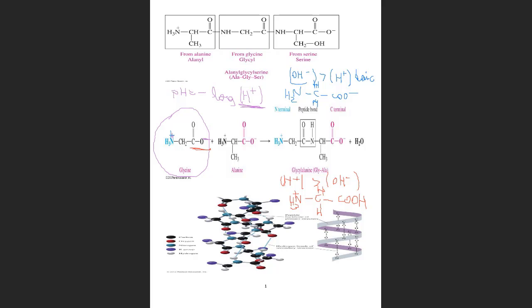Once we have the solid, we will determine the percentage of casein in milk by weighing a sample of milk and then weighing the amount of casein that we isolated. This is the experiment we are going to do to test the solubility of casein. And then we will do 3 chemical tests. So let me share the page of the experiment.